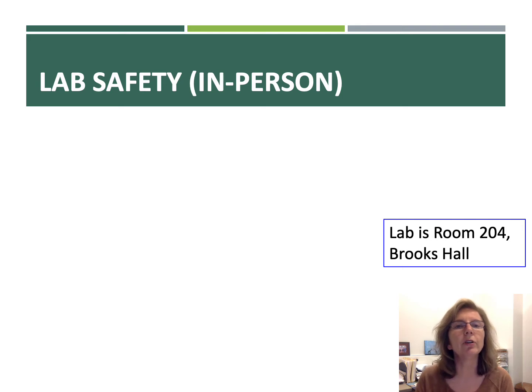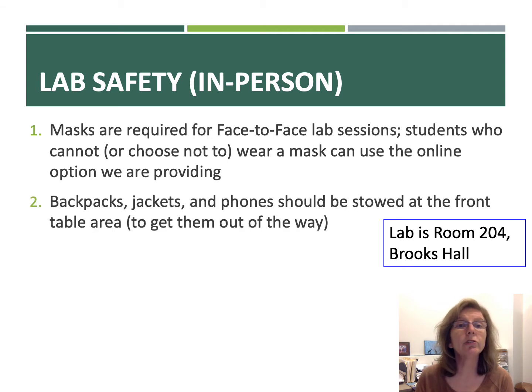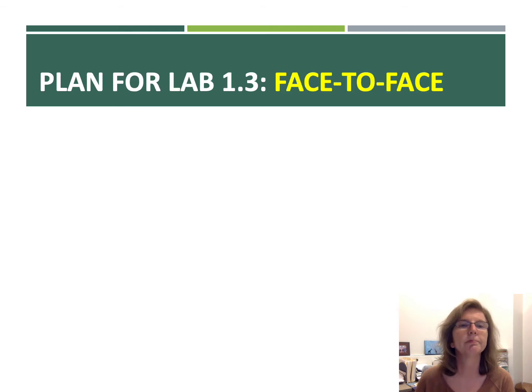So since this is our first face-to-face lab of the semester, we need to review some lab safety. Masks are required. Backpacks, jackets, and phones should be stowed at the front table area to get them out of the way. There's no food or drink in the lab. And everyone should wear long pants and closed-toed shoes for safety. And lastly, you should wear gloves when you're told they're necessary, and gloves are necessary when we're loading and running an agarose gel.